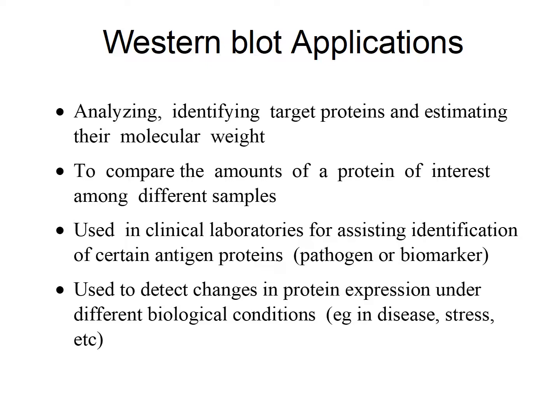So Western blot finds potential target proteins we're interested in. We can figure out, if we don't know their molecular weight, how much protein is there. So the amounts of different proteins. If there's a virus or a bacterial protein, we can detect pathogen in a patient's blood or lymph or spinal fluid or nasal secretions or biopsy, and other kinds of cancer biomarkers. We can use Westerns here.